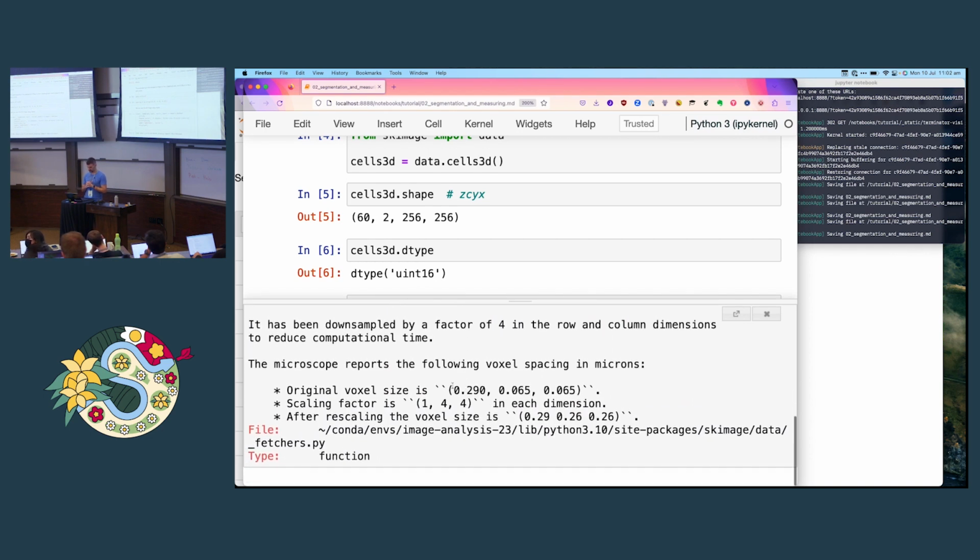And now we're going to look at the viewer. And actually, I want to show switching between 2D and 3D, so I'm going to get rid of this line. Actually, I'll just comment it. Okay. So we add Cells 3D. We tell napari what the channel axis is, which is 1. So the channels are on the first axis, if you're doing 0 indexing.